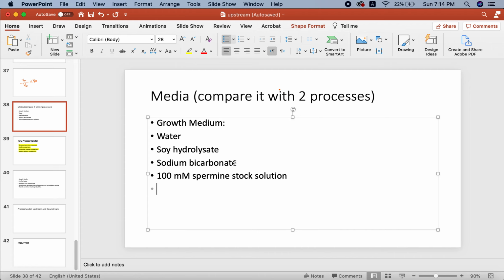In general, the rocker speed may be dependent on culture volume. Lower culture volume requires lower rocker speed. However, a single rocker speed and rocker angle should be used for both stages, if possible. If excessive foaming is observed, reduce the rocker speed and/or the angle, or a combination of both.